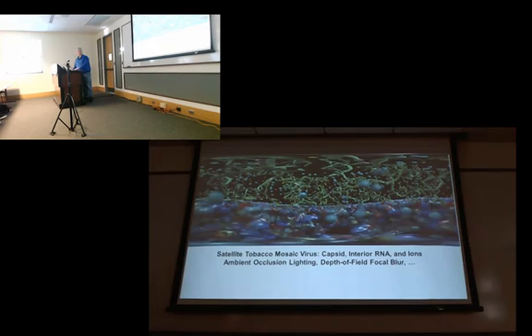The challenges we have to overcome are, how do you work while wearing what is essentially a face mask that excludes all of your room, and how do you collaborate with the person standing right next to you or your experimental colleague across the country? There are lots of challenges to be solved, but the cool part is we can do all the same kind of rendering in a virtual reality environment. This is a spherical projection, kind of like if you unfolded a world globe onto a planar sheet. We can do all the same kinds of rendering in VR that we would do conventionally, so that's very exciting.